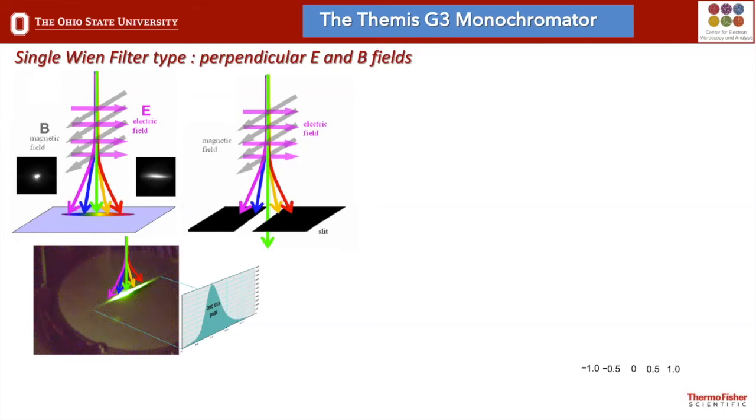That's just how electron optics work. And so by reducing the energy spread in the beam, that's another step we could take to increase the energy resolution or the spatial resolution in the microscope. So by doing this, we're not only reducing the energy spread, but we're also improving the spatial resolution a little bit because we're reducing the chromatic aberration.